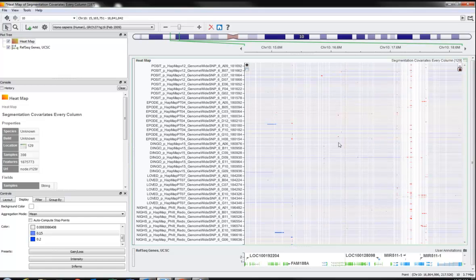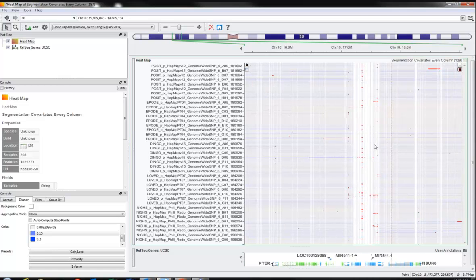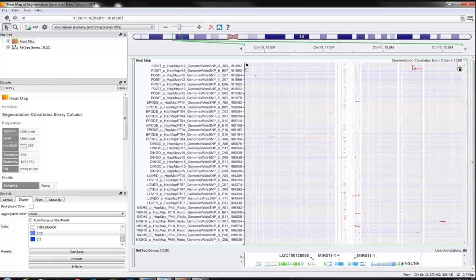So we can explore the data like this by focusing on those intensity values rather than trying to classify anything that might turn out to be a bad classification. Here we have a rare deletion popping out, another rare deletion popping out down here.